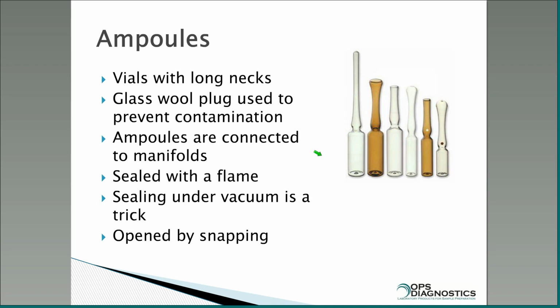The other thing I don't like about ampoules is that to open them, you have to snap them. And I know at least once I've cut myself doing this, which is not necessarily a fun thing. So you have to be careful. Get pre-scored ampoules. They have a little ridge cut around there so that they snap off nicely.